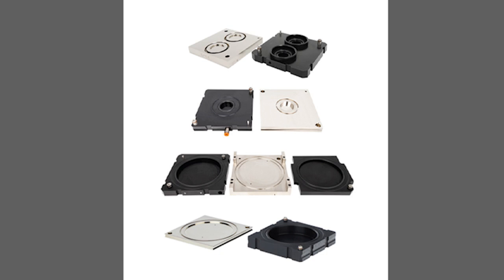These ones here are actually kind of neat. They're for coated papers or paper boards, for something called edge effect. If I was just going to clamp my paper in this top cell here, because paper's so porous, you can actually get oxygen or humidity coming in from the edges, from the ambient around you, that are impacting the transmission rate. So we've got ways to cut off or block those edges. Sometimes people can only provide small samples. They can't give us a larger piece, that coffee mug size at 4 by 4 inch square that we need. So we've got cells that can test smaller samples, and that works out very nice.